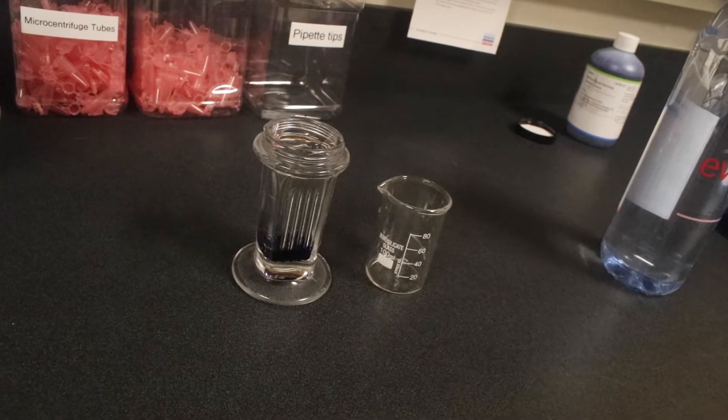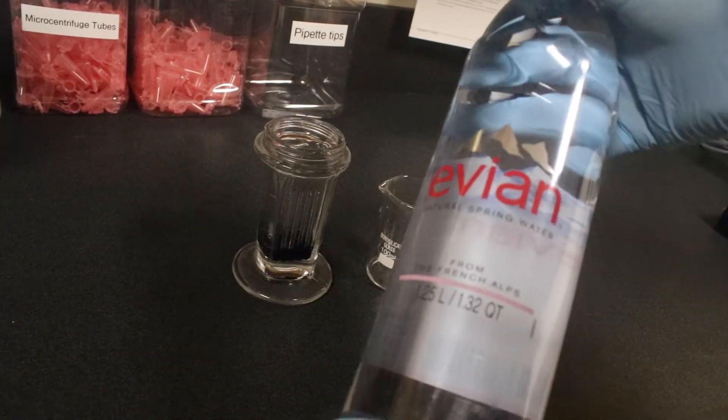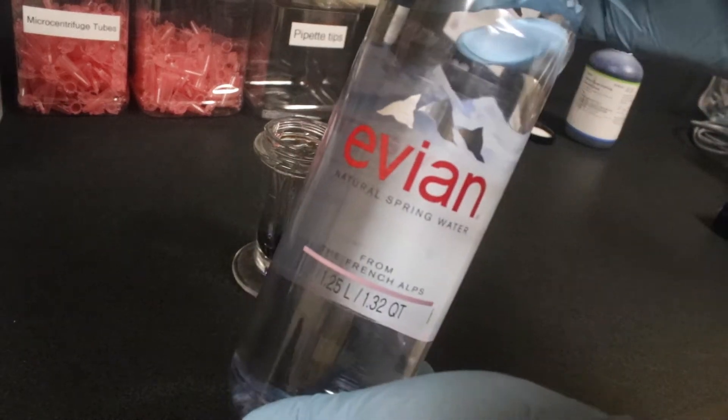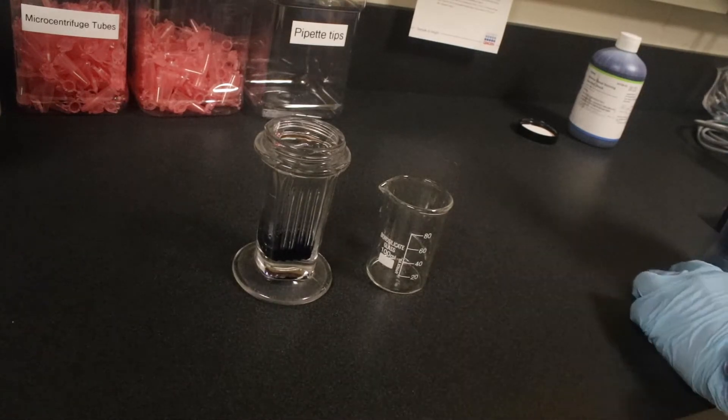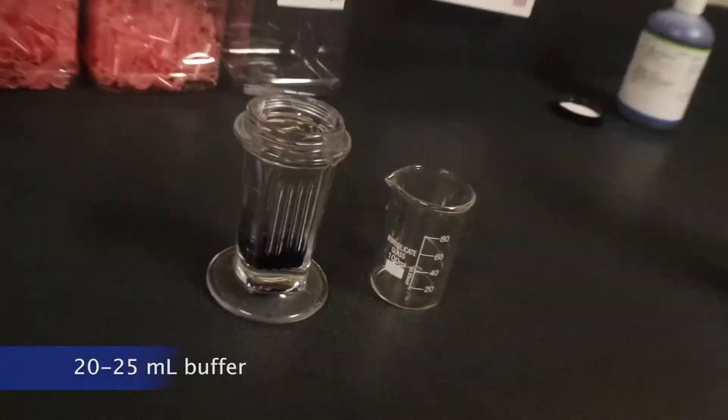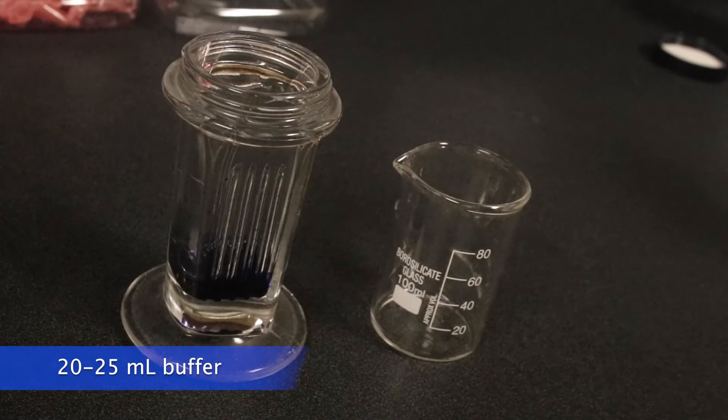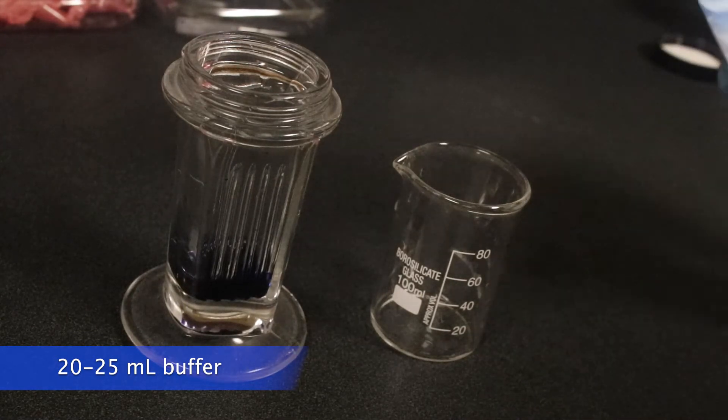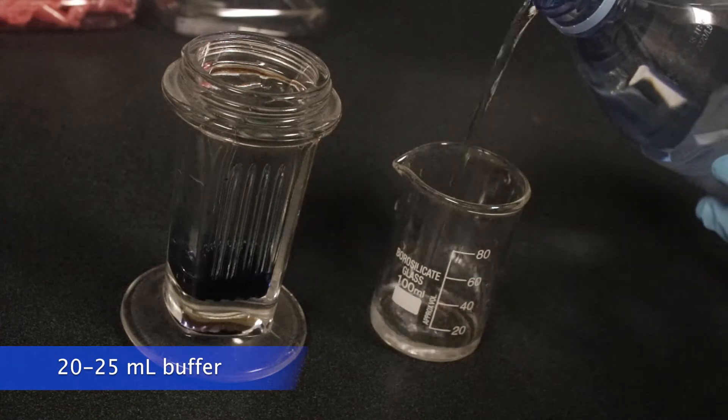Next we're going to add the buffer. So, grab the bottle of Evian water, and into a small flask, a 100 milliliter flask, pour out 20 to 25 milliliters of Evian water, and then we can pour that in with the Yamsa concentrated stain.